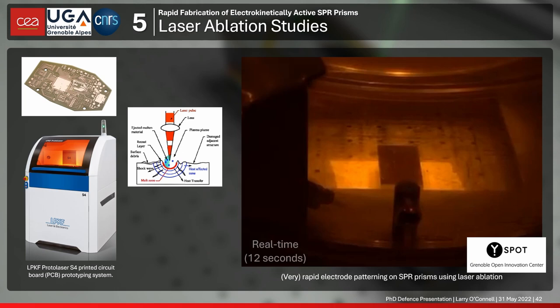What we found was that we could adapt a printed circuit board prototyper based on laser ablation. This machine is normally used for prototyping printed circuit boards at length scales much larger than the electrode arrays we needed. My colleague Bryce Poirier and I found that by pushing the limits of the device and playing around with the pattern parameters, we could get very good results in patterning these electrode arrays. I'm going to show you the entire process for producing them by laser ablation.